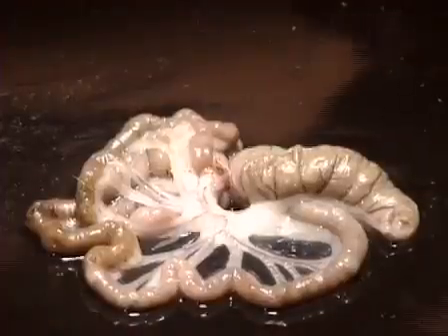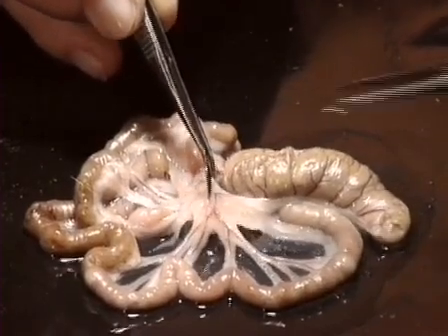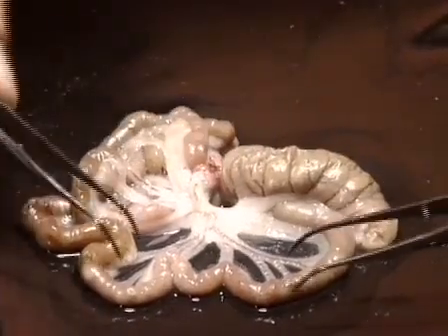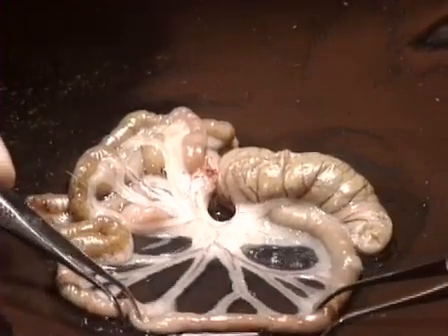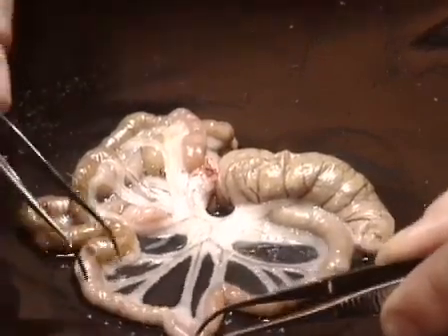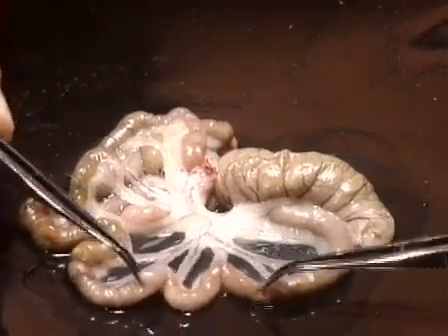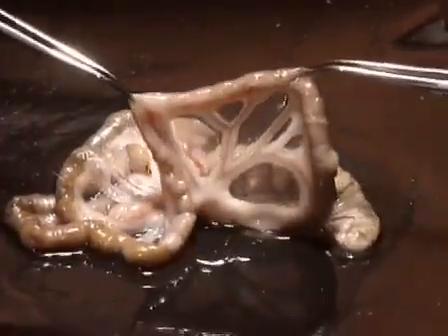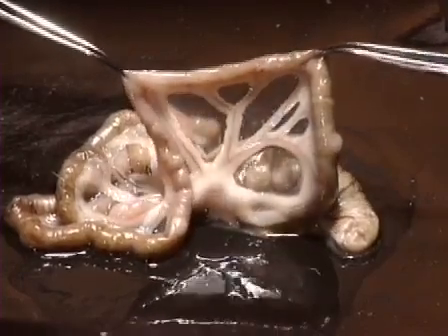In adult male rats, the mesenteric windows are natively vascularized and lack measurable physiological angiogenesis. They thus provide an opportunity to study de novo angiogenesis in adult, natively vascularized mammalian tissue, i.e., the initiation of a full angiogenic response from scratch, overcoming the angiogenesis inhibitors that operate endogenously in the test tissue, as in all normal tissues. In mice, native microvessels that can act as parent microvessels are absent in many windows, which unfortunately makes the assay unpredictable in mice.